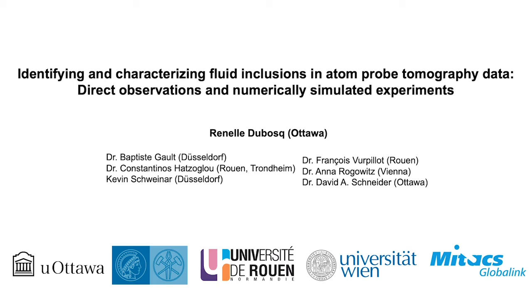Hello, my name is Renelle, and in this presentation I will talk about how to identify and characterize fluid inclusions in atom probe tomography data.